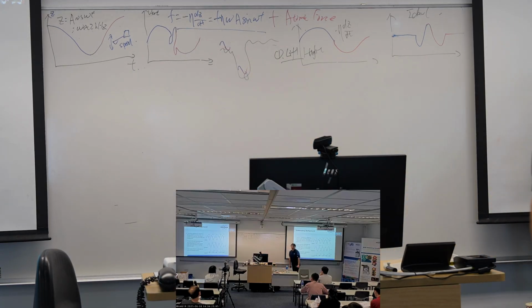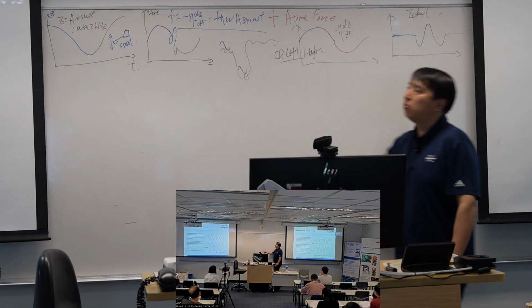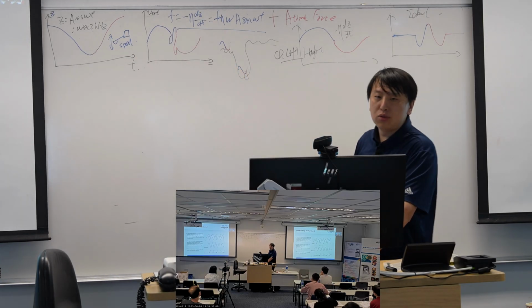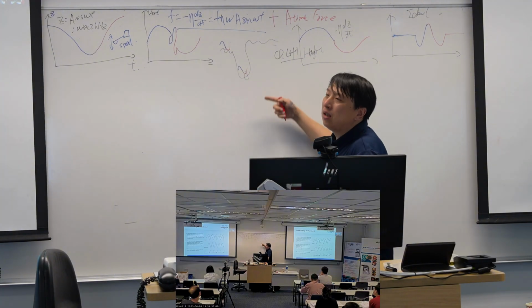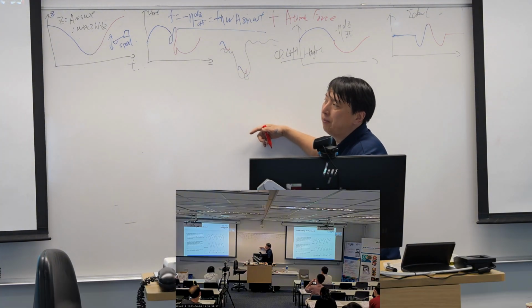they may be different. Because, of course, the hydrodynamic force may be the main component, but the viscosity can be changed due to the sample environment. So we cannot assume the background is always the same.